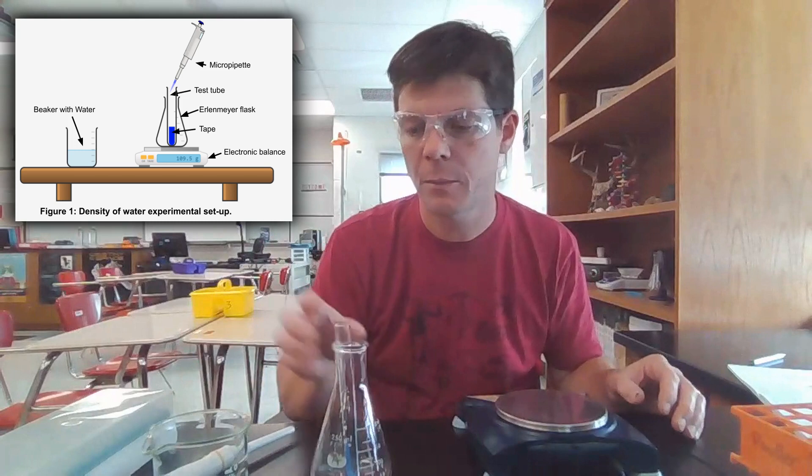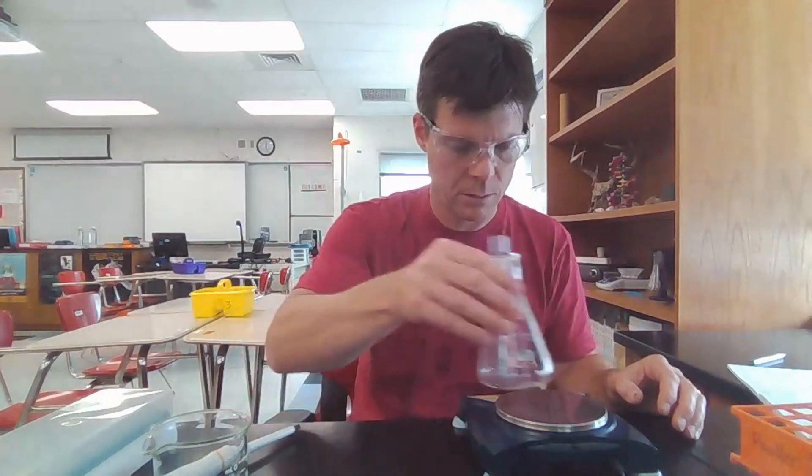First, let's determine the mass of the test tube and Erlenmeyer flask. 109.5 grams. The reason to measure the mass of the Erlenmeyer flask and test tube empty is so that we can later compare that mass to the new mass that happens when we're adding liquid into the test tube.